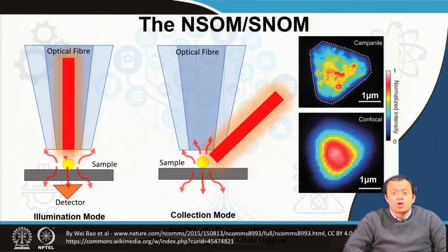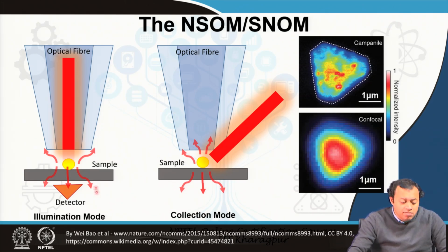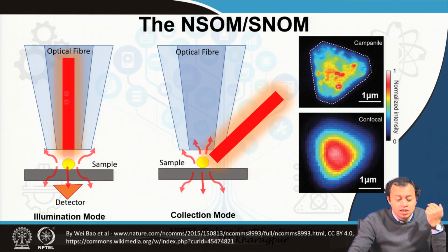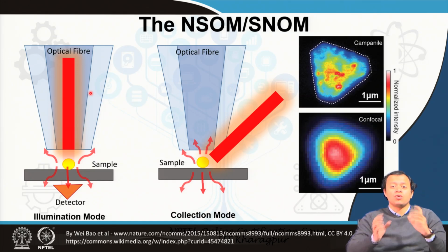One word, nanotechnology. We now have incredibly sophisticated detectors that can detect one photon. Even if one photon is emanated, we will be able to detect it. We have that technology right here, right now. We even have optical fiber. We even have stages that move at 1 picometer per second, believe you me, 1 nanometer per second. It can move in xy direction, even z direction, and we can bring materials or optical fiber with stages as close to 50 nanometer with the help of nanotechnology stages.